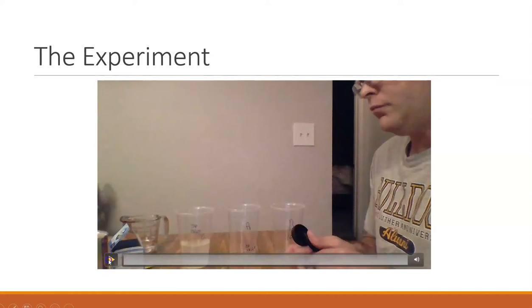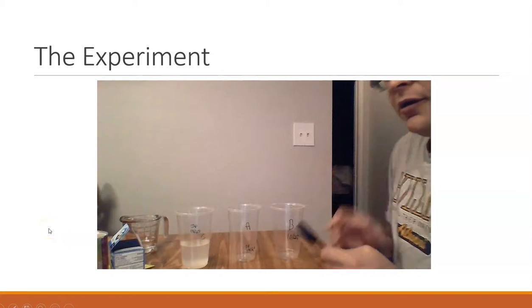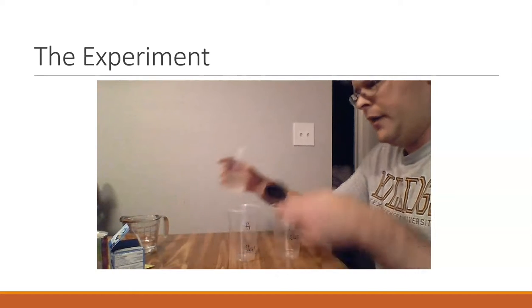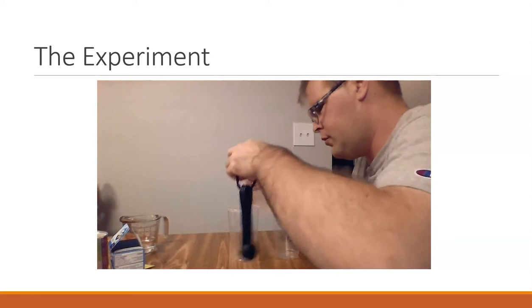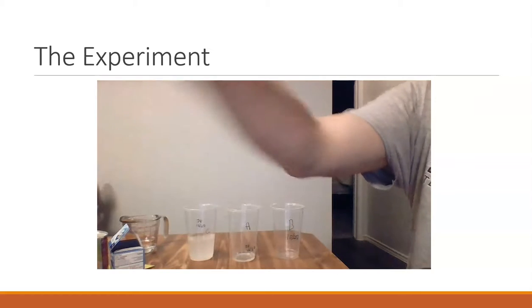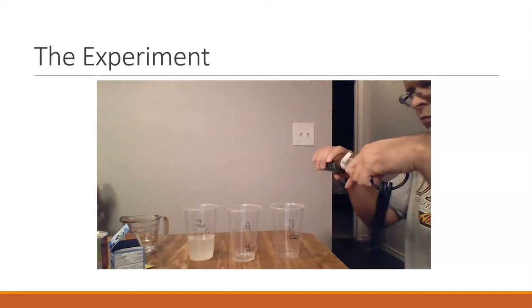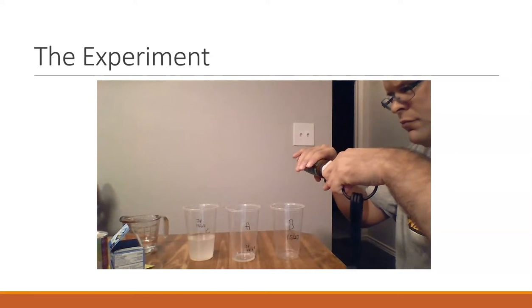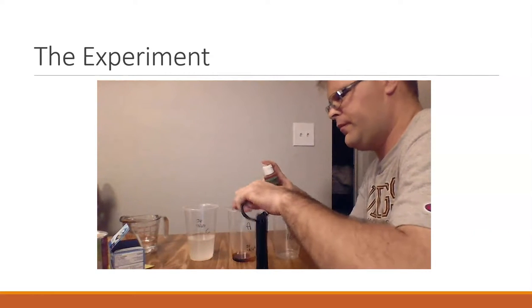Alright. Okay, here's your solutions. The vitamin C stock has already been made. We're going to put some of this into solution A. Careful not to spill the iodine.